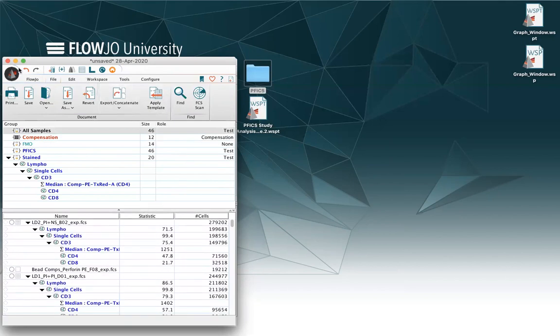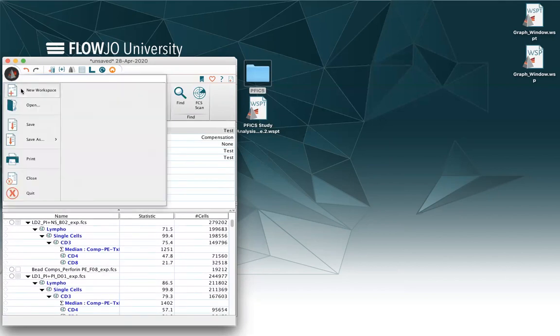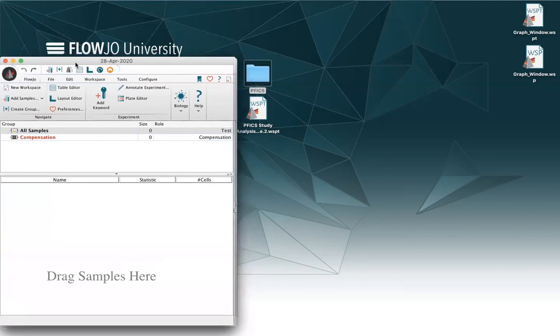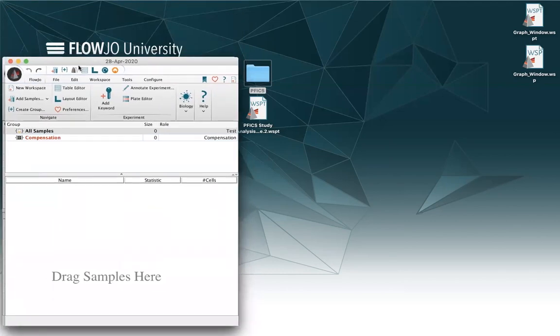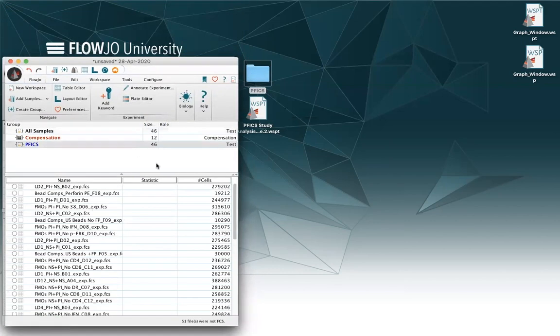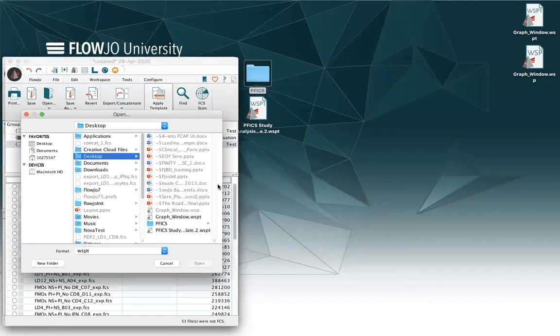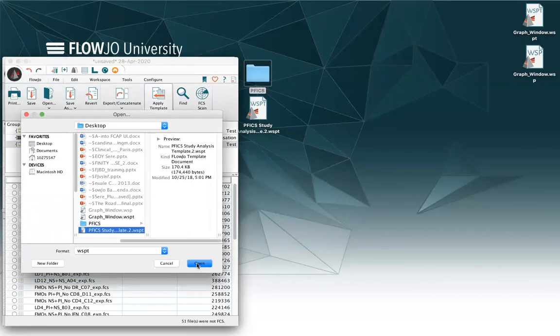Same thing if I open up a new workspace and apply a different template to it, like this one.